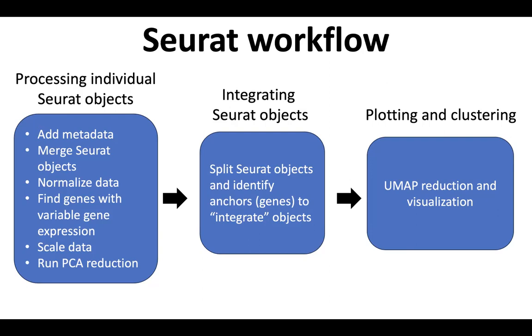First, we split the Seurat objects before identifying the anchors. Anchors are genes that are expressed somewhat similarly between two conditions, and we can use these to integrate these objects. They're anchors that are helpful for scaling and integrating these two data sets together.